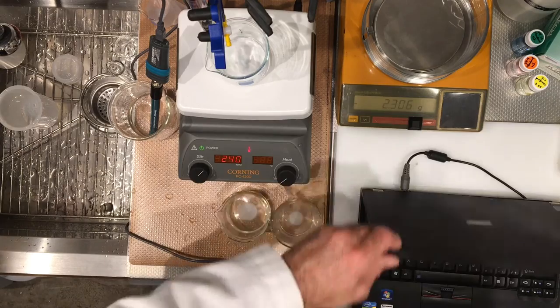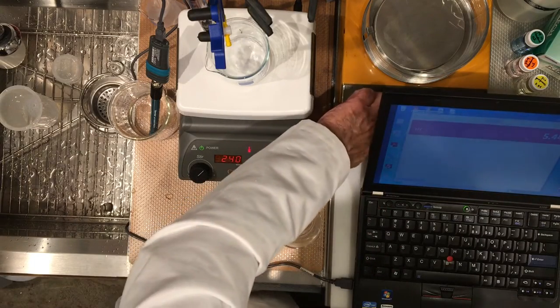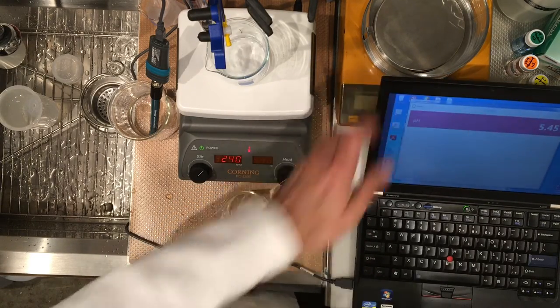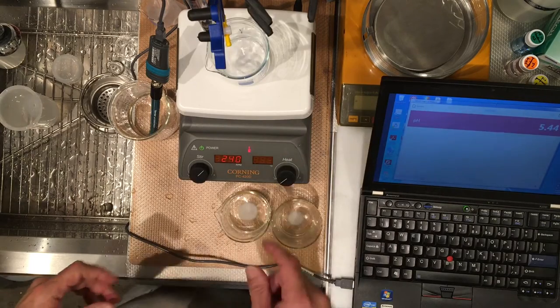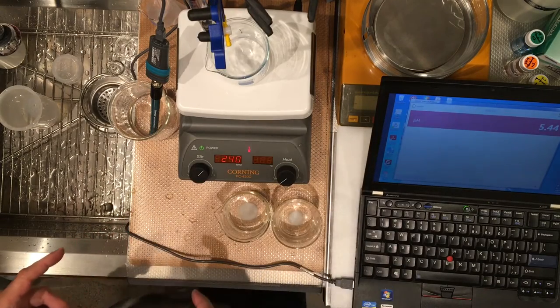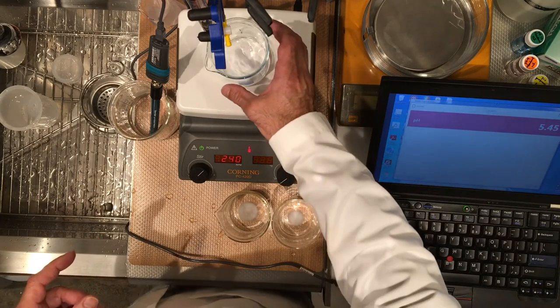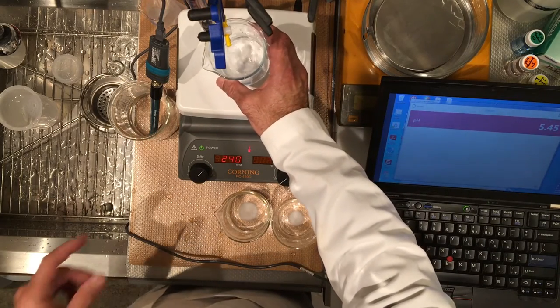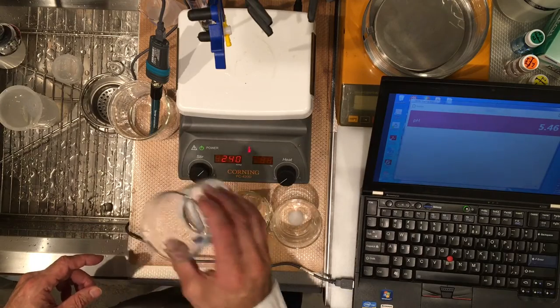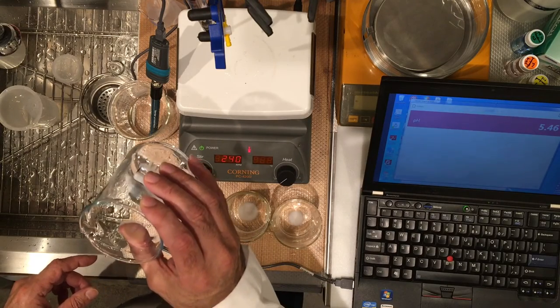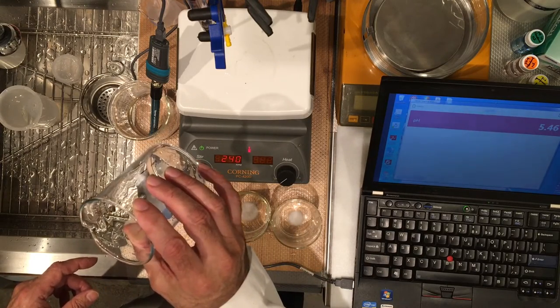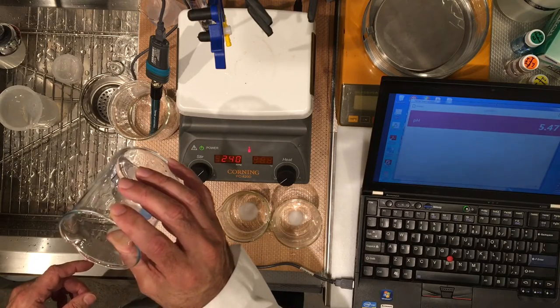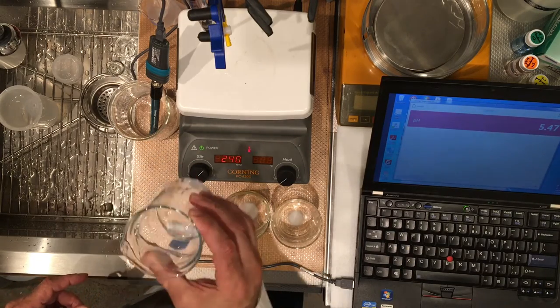All right, now I'm showing you the screen where we have the pH measurements. I haven't put the probe in yet, but I'd like for you to record the pH value as well, but let me just make sure that this is dissolved. Looks like it's pretty dissolved. I don't see any powders in there.